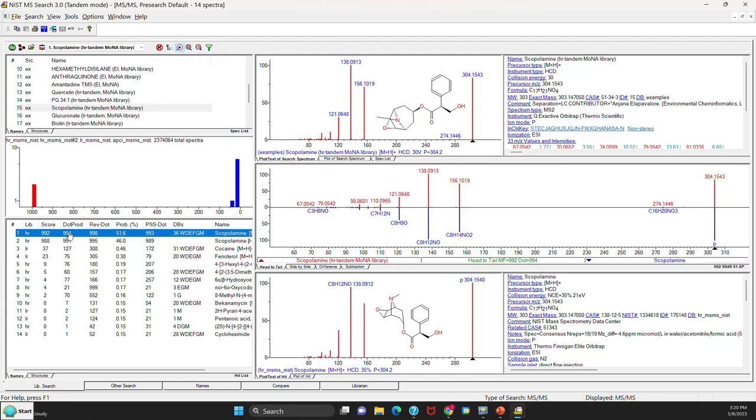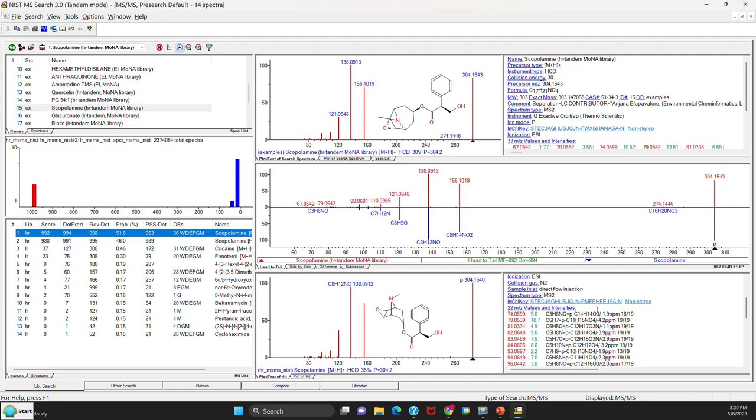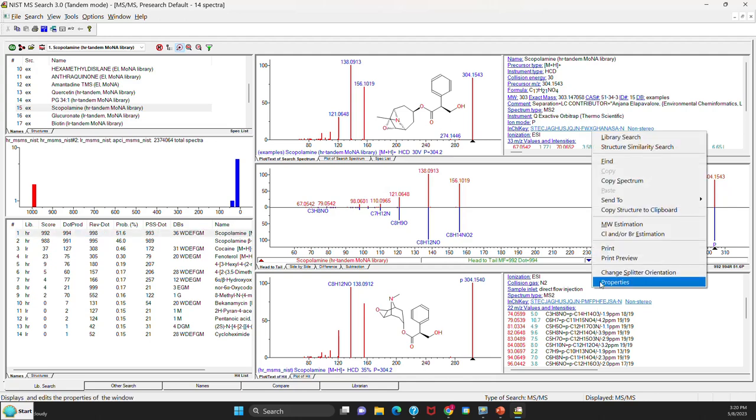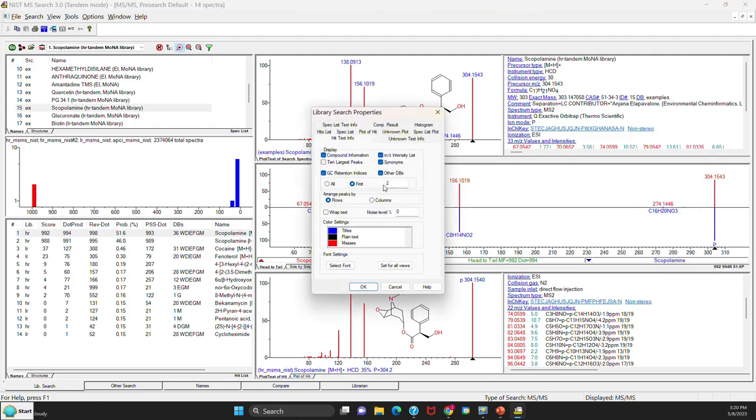Let's take a closer look at some of the results. I'll select the best hit in the results, which is hit number one here. And then go to the bottom window. When I'm looking at the results in the bottom window, I find it very useful to get rid of some extra information that I'm not really interested in. So I go to properties.